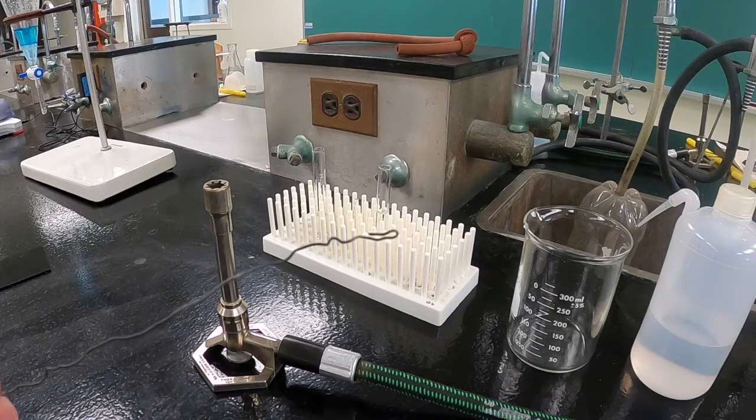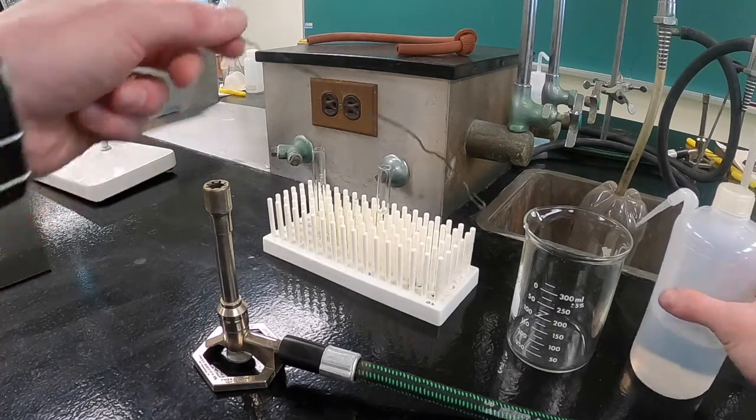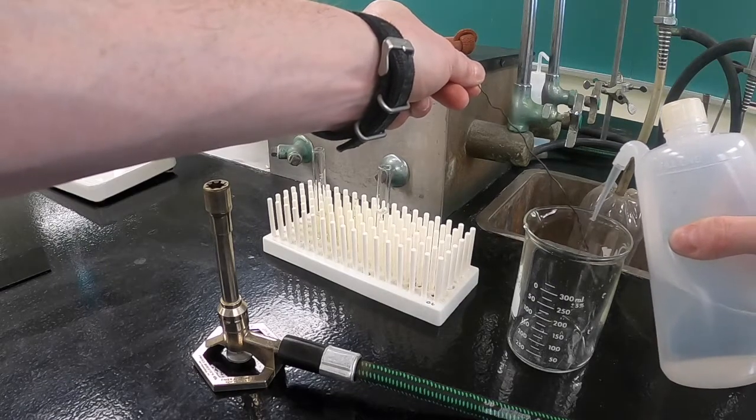The first step in a flame test is to take your metal wire and rinse it with distilled water to make sure that any contaminants have been removed.